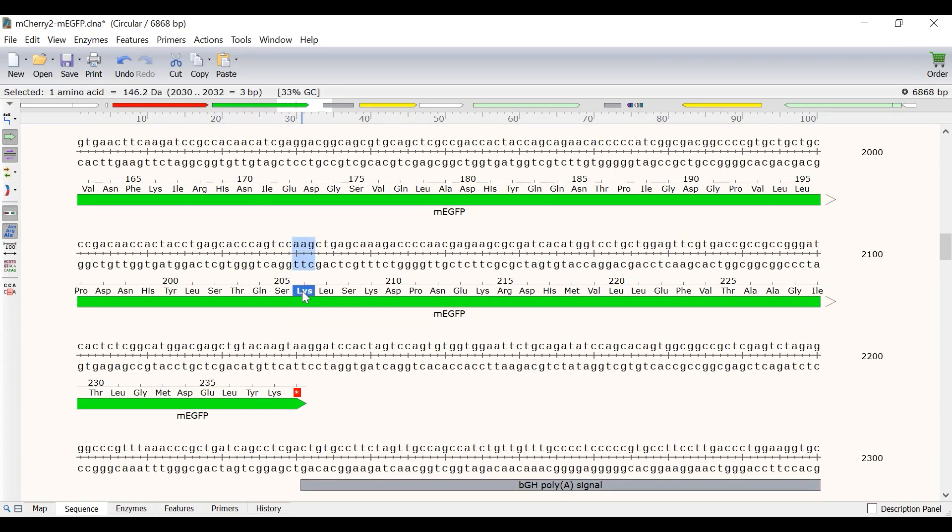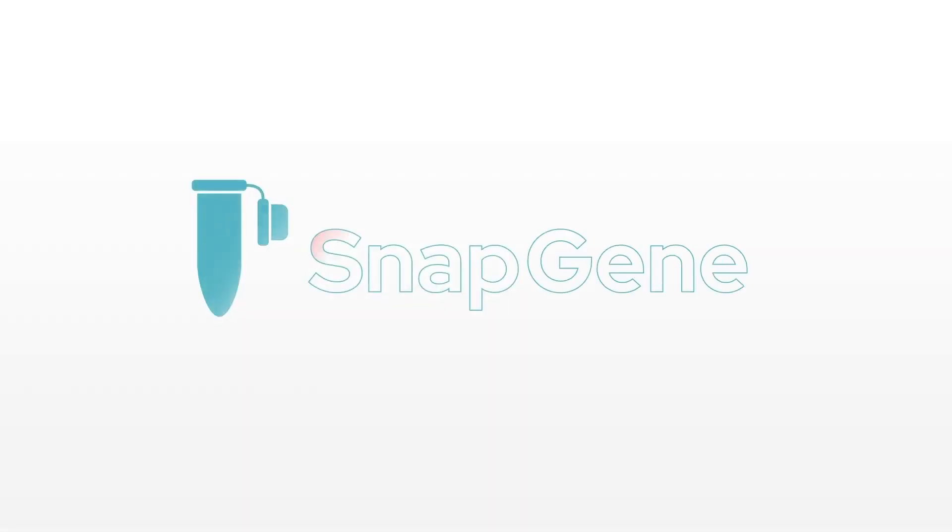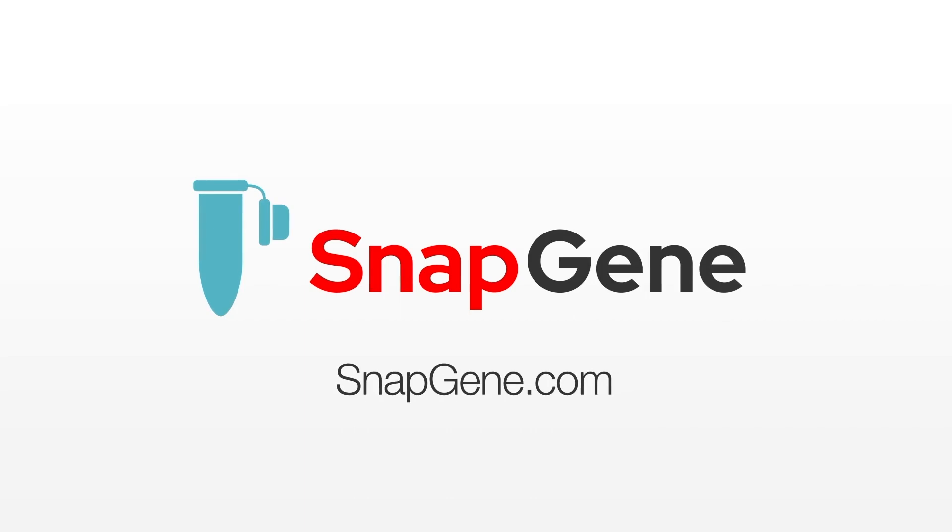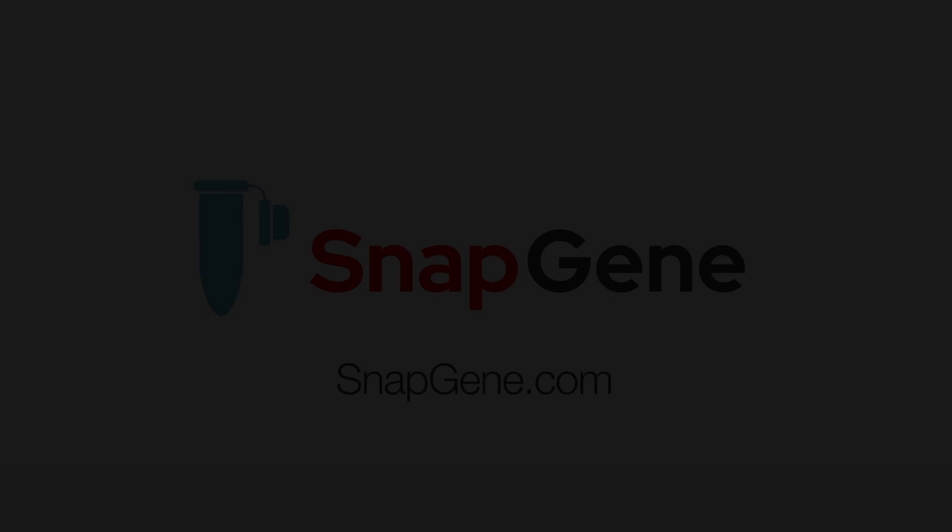And that wraps up this video tutorial. You now understand some of the main capabilities Snapgene has when working with translations. For other Snapgene tutorials, check out the other videos on the Snapgene website.